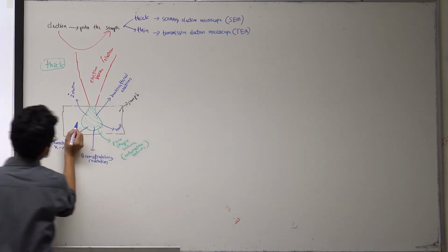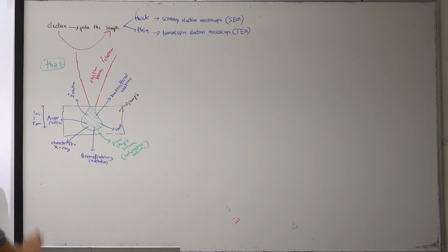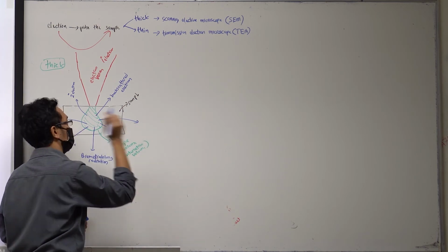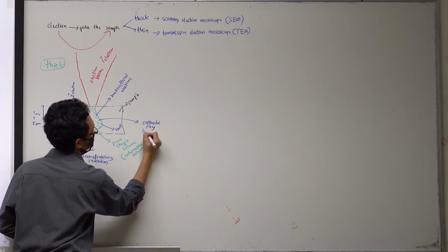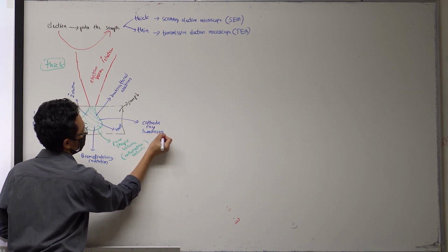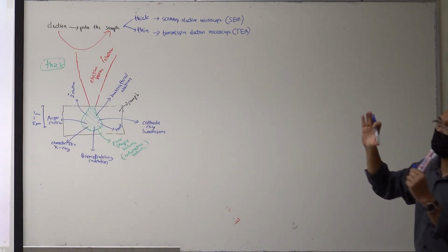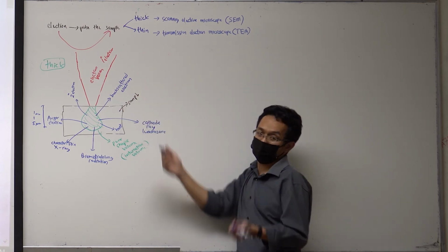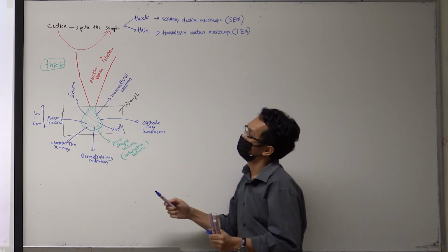And also you can have the name Auger electron. Actually there are many more. There are also cathode ray luminescence, plasmon, surface plasmon, and so on. So you can see, the one that I want to tell you is that when the electron hits the sample, many things happen. It's not just simply like that.